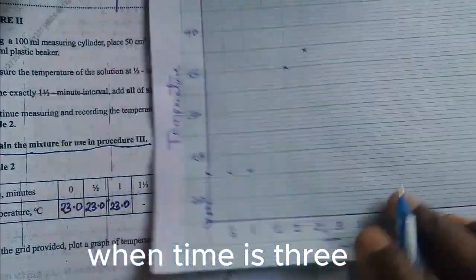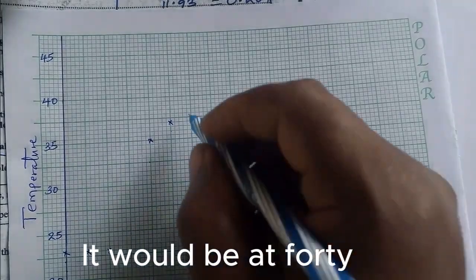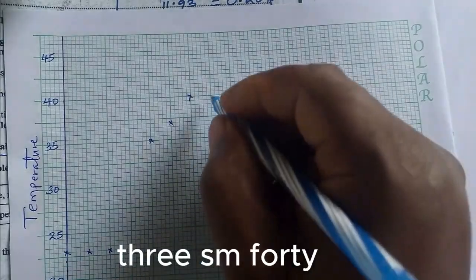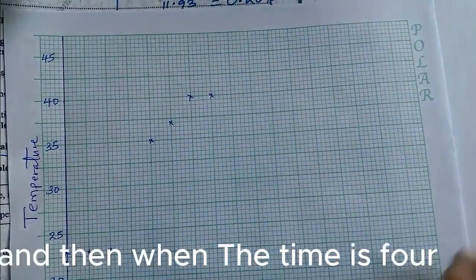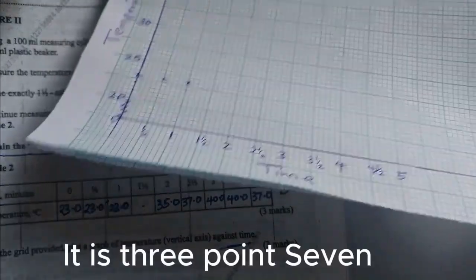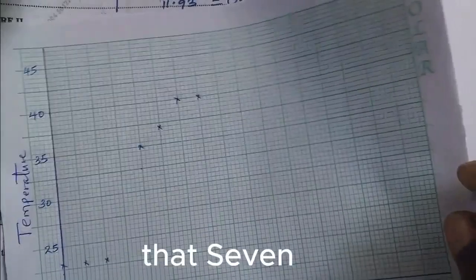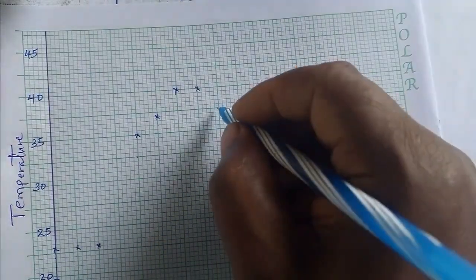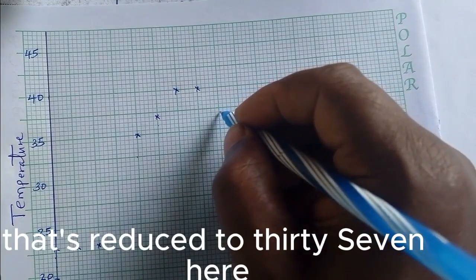When time is 3, that is 40. When time is 3.5, it is the same 40. And then when the time is 4, it is 37, sorry, at 4, 37. That's reduced to 37 here.